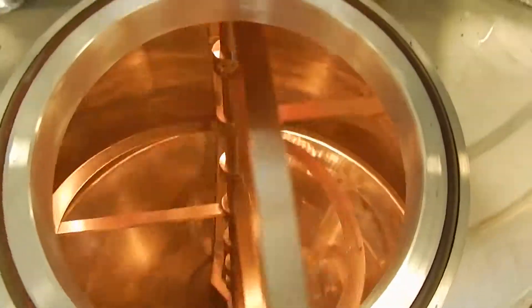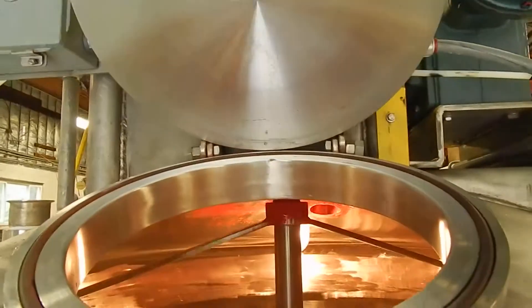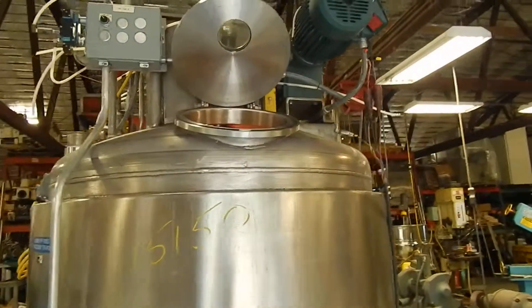There's an air-operated lift on the cover up here, which also has a sight glass through it. A number of top inlets are included — three inch tri-clamp.